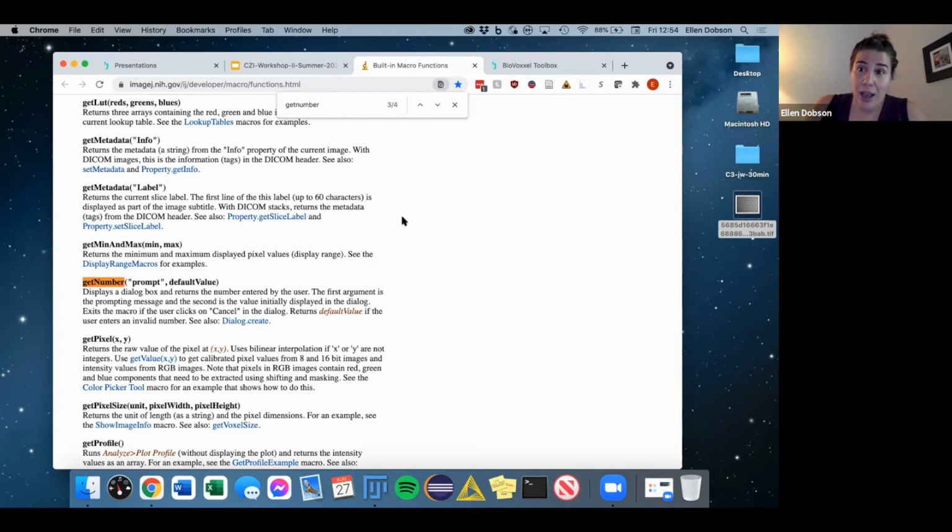So this is really a handy thing if you're like, I know I want to draw a line and I can't remember how to draw a line. Then you can just search in here for line and find the code call for drawing a line and get the two different X and Y coordinates, and then you know exactly how to do it. You don't have to remember exactly how to call the code. You just have to generally remember what you want and then search for it in here, and it'll help you. It'll just ease your scripting. Okay.